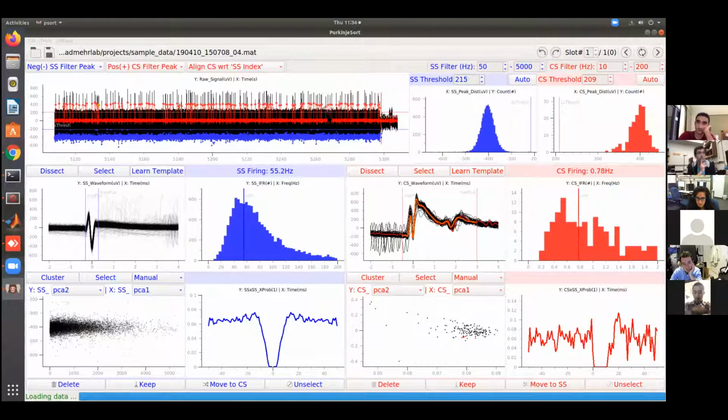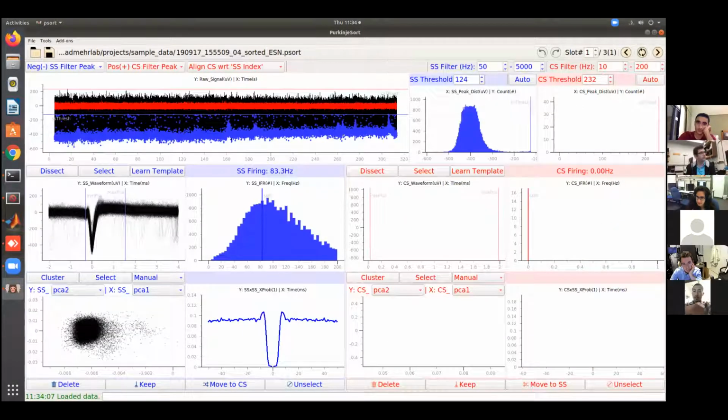And this happens a lot, especially with the Cambridge recordings. So this is a session where those peaks that we saw in the LFP content no longer exist. But I know that this session has simple spikes and complex spikes. So this is where the magic of the UMAP will come into play. So what will happen is that I can bring this down and start.